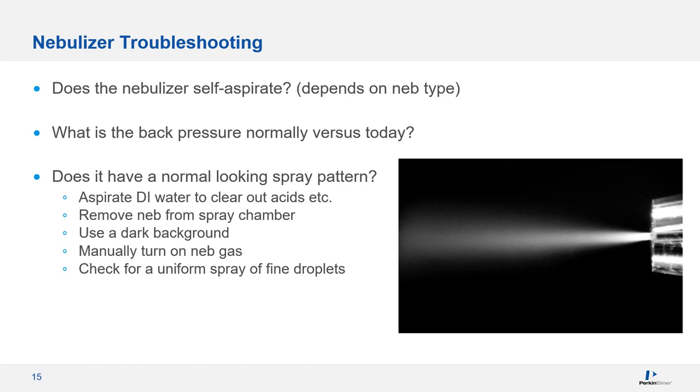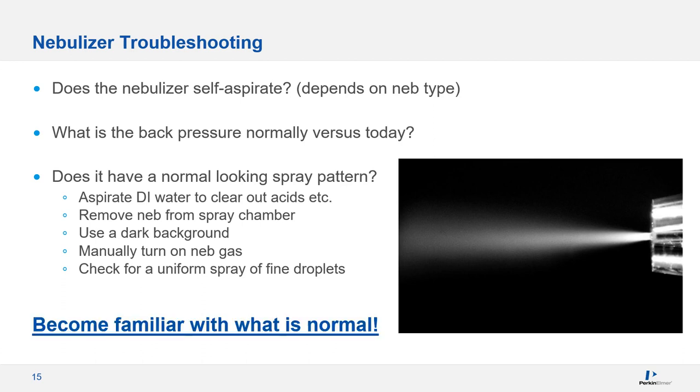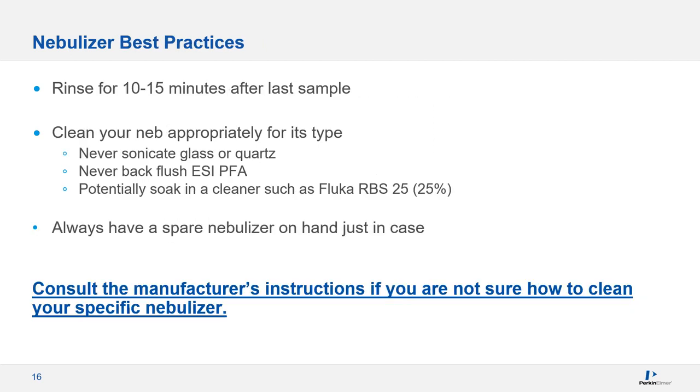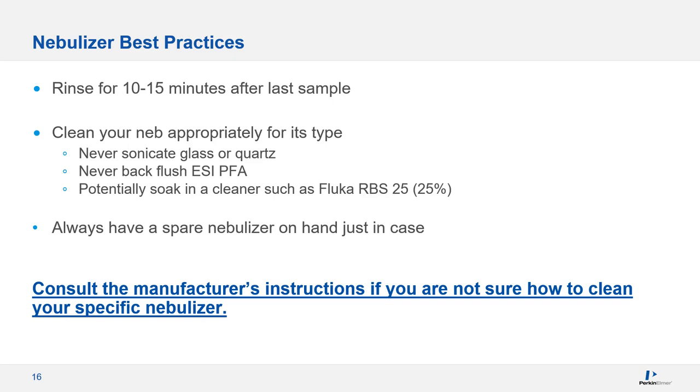Most importantly, be sure that you don't just look closely at performance when there's a problem. You need to be comfortable with what normal looks like before you can say what doesn't look right. Really though, the best approach is to prevent your nebulizer from getting clogged in the first place. The easiest way to do this is to make sure that you rinse with a clean blank solution after the last sample of your run for about 10 to 15 minutes. This is best done with the plasma still on, which will prevent any salts that are in the spray chamber from depositing on your nebulizer again.